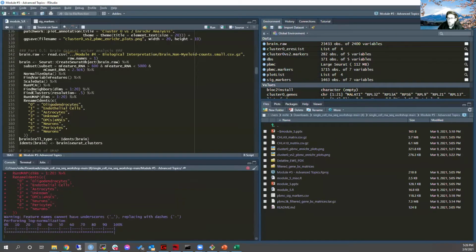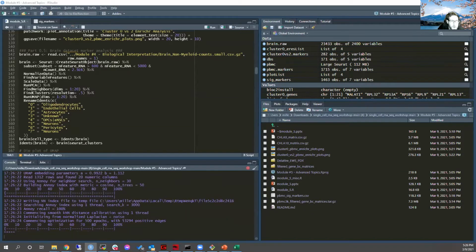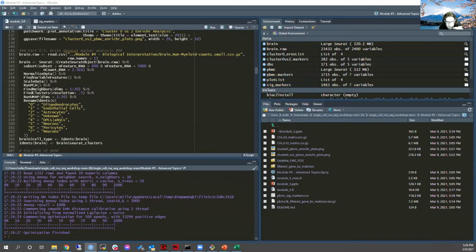While this is running, I'm going to address something Wes said here. Wes said that in Seurat 3 or below, for anyone copying and pasting, average log fold change is average log 2 fold change. Seurat has a habit of changing, with every new release, the way things are spelled or the names of functions.